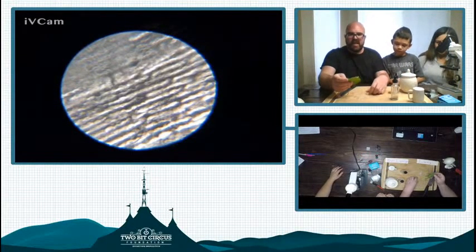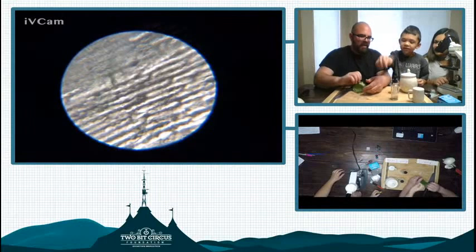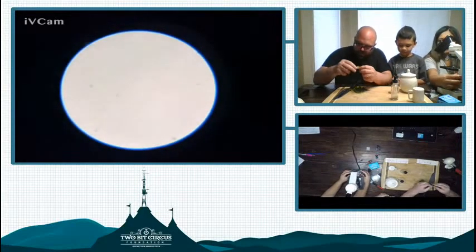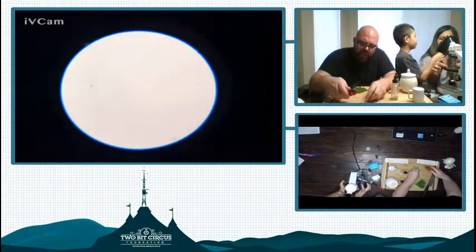What's our next one that we could test out here? Which one do you want to see? You want to look at the living or not living leaf? Or you want something else? I like this leaf. That leaf? All right. So we could try a couple things here. The leaves are challenging too, to try to get a thin layer of the leaf. I don't know if I'll be able to separate it.